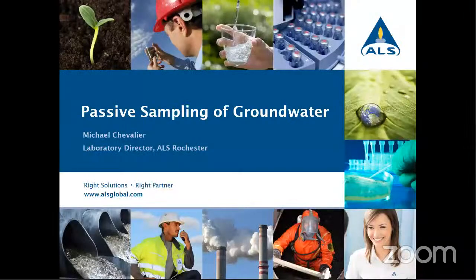ALS Rochester. Appreciate everybody joining me today to talk about some passive sampling of groundwater, what it is, how it might be beneficial for you, some of the pros and cons, and how ALS might be able to fit into that equation to help support some of your projects.